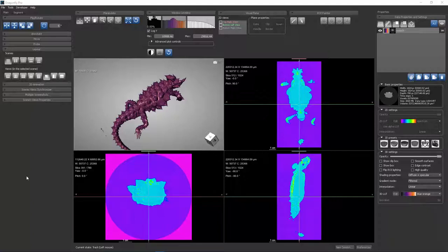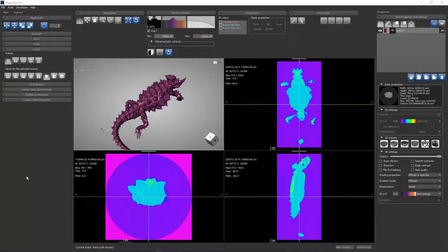The LUT behavior in Dragonfly 3 is independent for 2D, or our MPR views, from the 3D view.